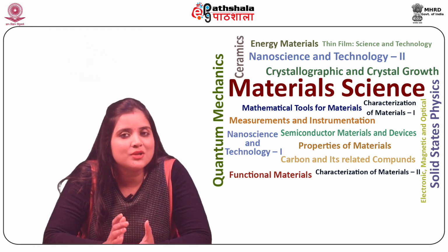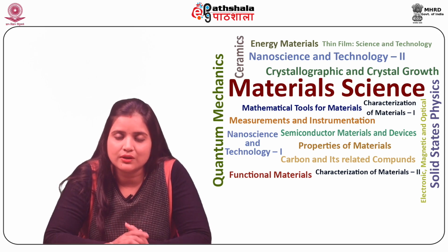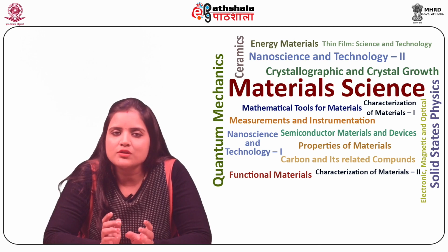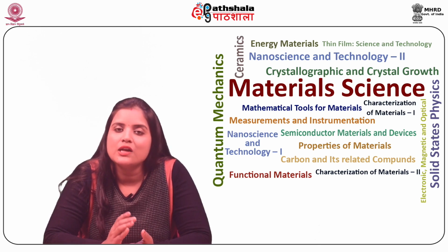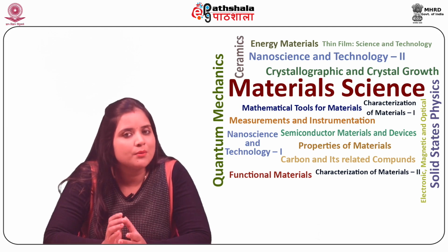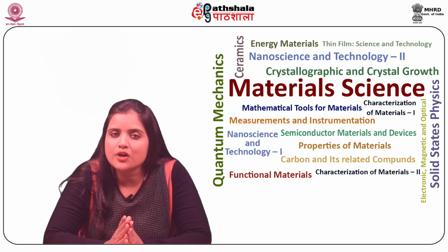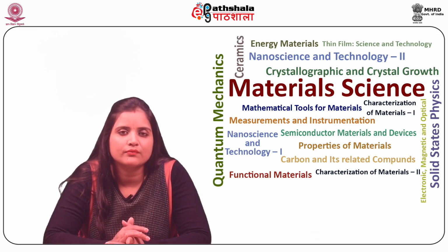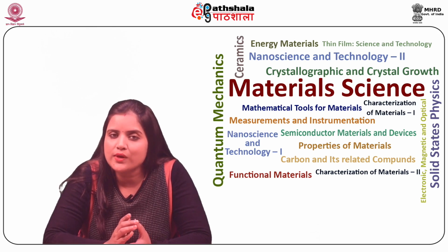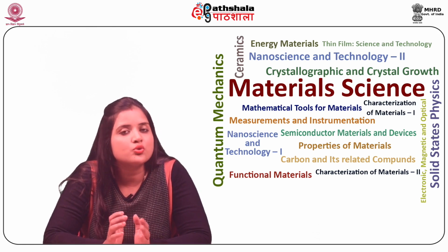That resolution is limited to the dimensions of the detector may also be thought of in terms of signal processing. Assume a sample consisting of co-sinusoidally varying features of spatial frequency alpha, that is, g of x is equal to 1 plus cos of 2 pi alpha x. We may model the near field probe as a rectangular detector of aperture d and response function s. Assume a relative motion between the detector and the sample with velocity v. This represents the scanning process and converts spatial frequencies to temporal ones.